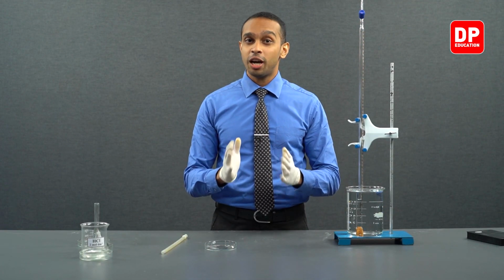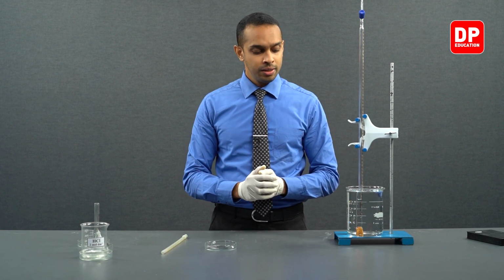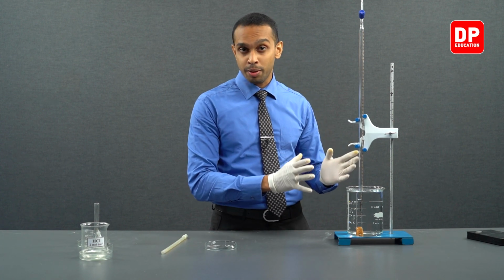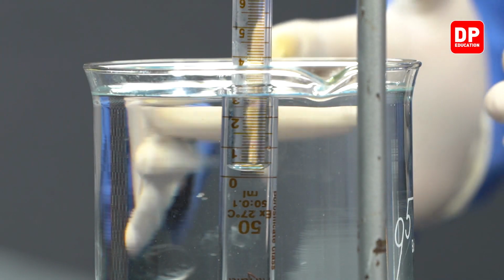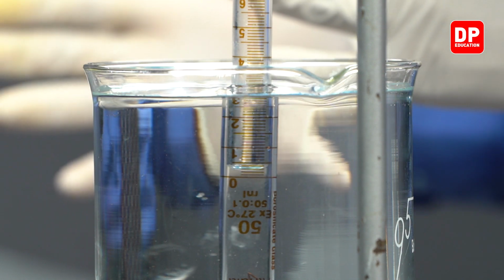Students, we have now completed this practical. We can see the reaction is no longer happening because you don't see any gas bubbles being formed here. You do not see the presence of the magnesium strip that we added in the beginning of the reaction, meaning all of the magnesium has completely reacted.